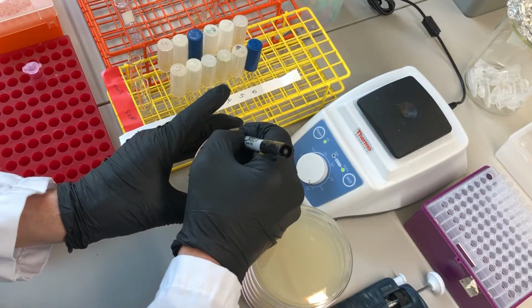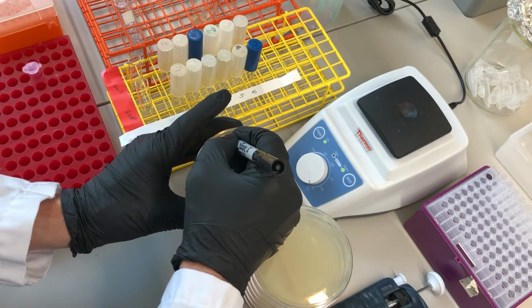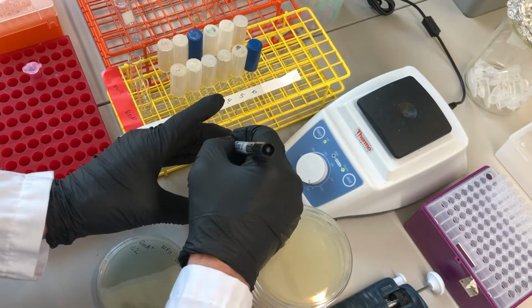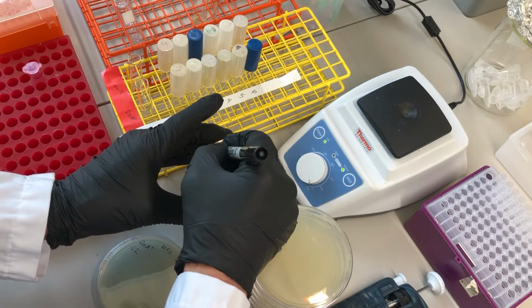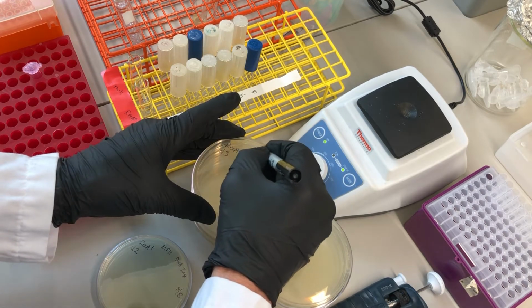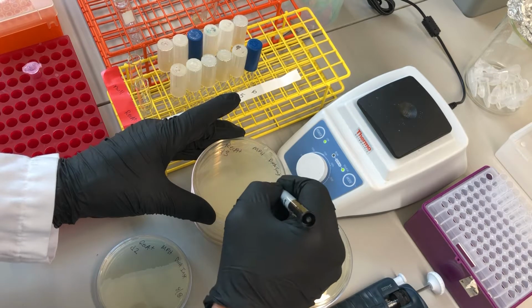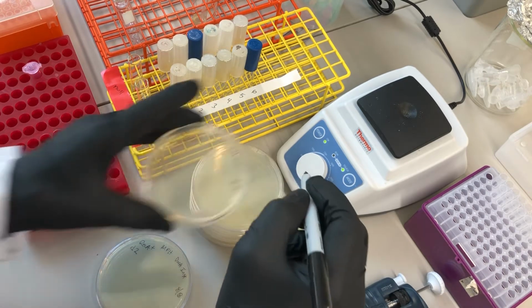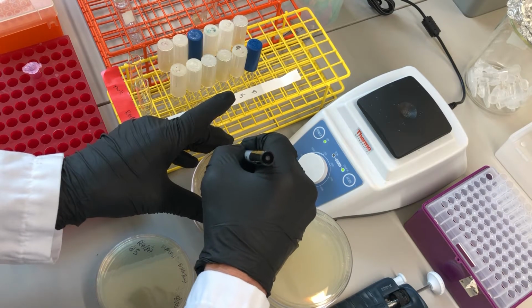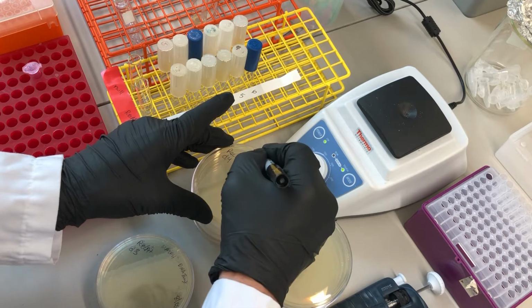So Rec A positive, dilution step 2. Rec A positive, dilution step 3. Dilution step 4.